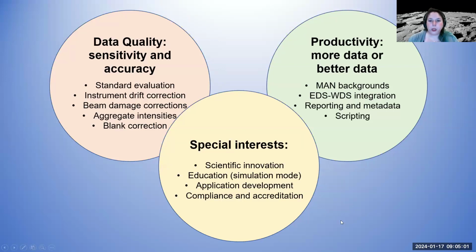So software usually has to cater to that, but also we are interested, of course, in productivity, and we have special interests depending on what the lab is. And so the Probe for EPMA software that I'm using in my lab is specifically catering to those needs.